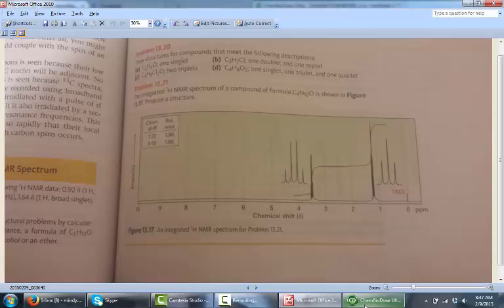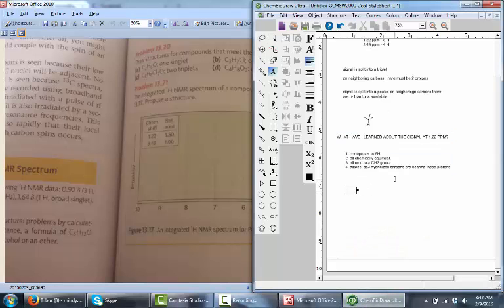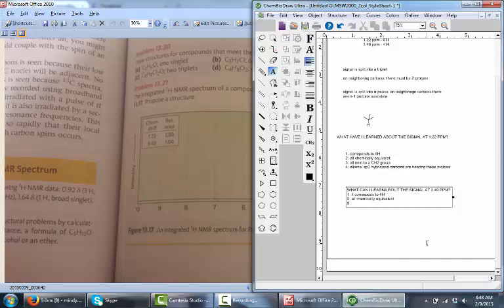can learn from here. Now, what can I learn about this signal at 3.49 ppm? A few things. It corresponds to 4H, 4 of my 10. Okay, those are also all chemically equivalent. And let's look at the splitting here. It's split into 4. That means it's next to a CH3. Okay, and I know that because it's split into n plus 1, so it's next to 3 H's. Therefore, it's split into 4.